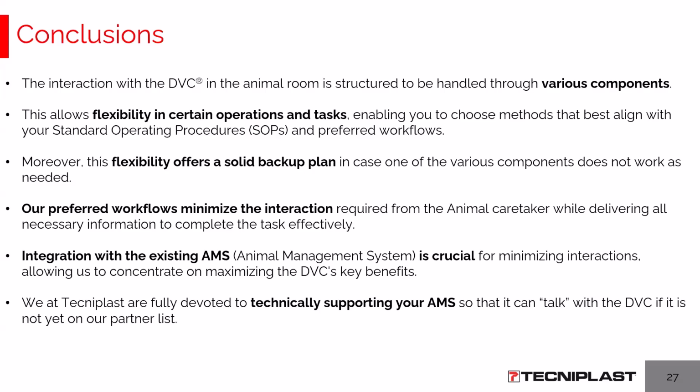Obviously, and this is fundamental to emphasize, you have to contact your AMS provider and discuss from a business perspective whether this has an impact on your maintenance or your licenses. From a DVC perspective, there are no extra costs, and we work to technically integrate the DVC with your AMS at no cost. For us, it's mandatory that you achieve such integration to ease the workflows, as we discussed.